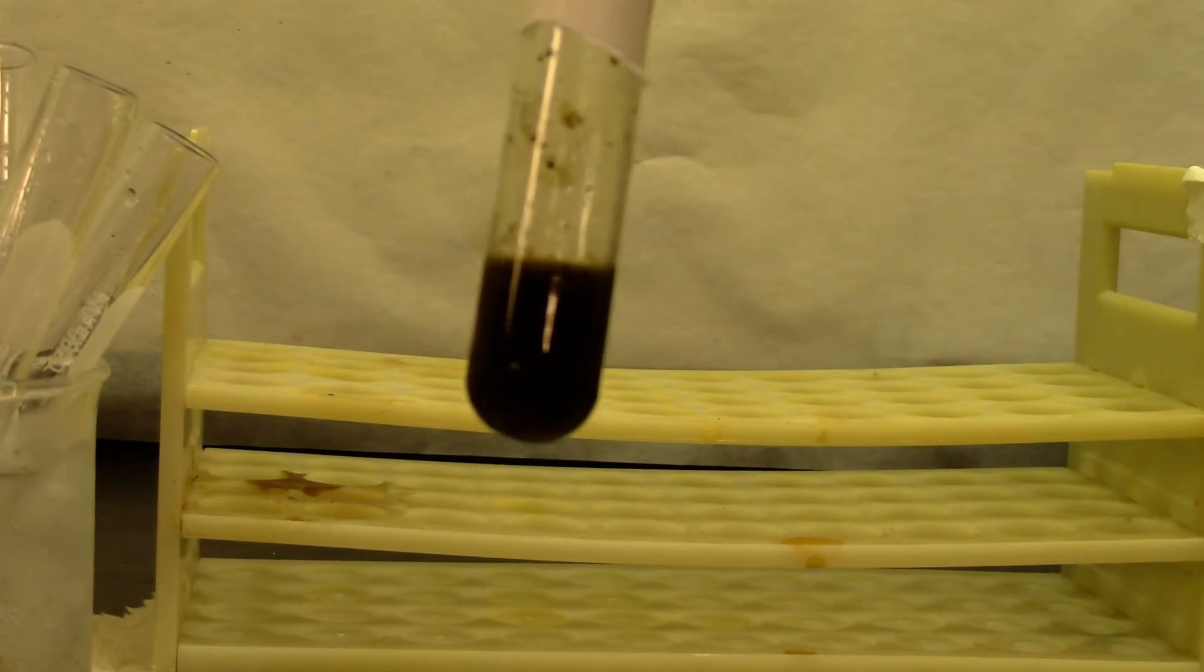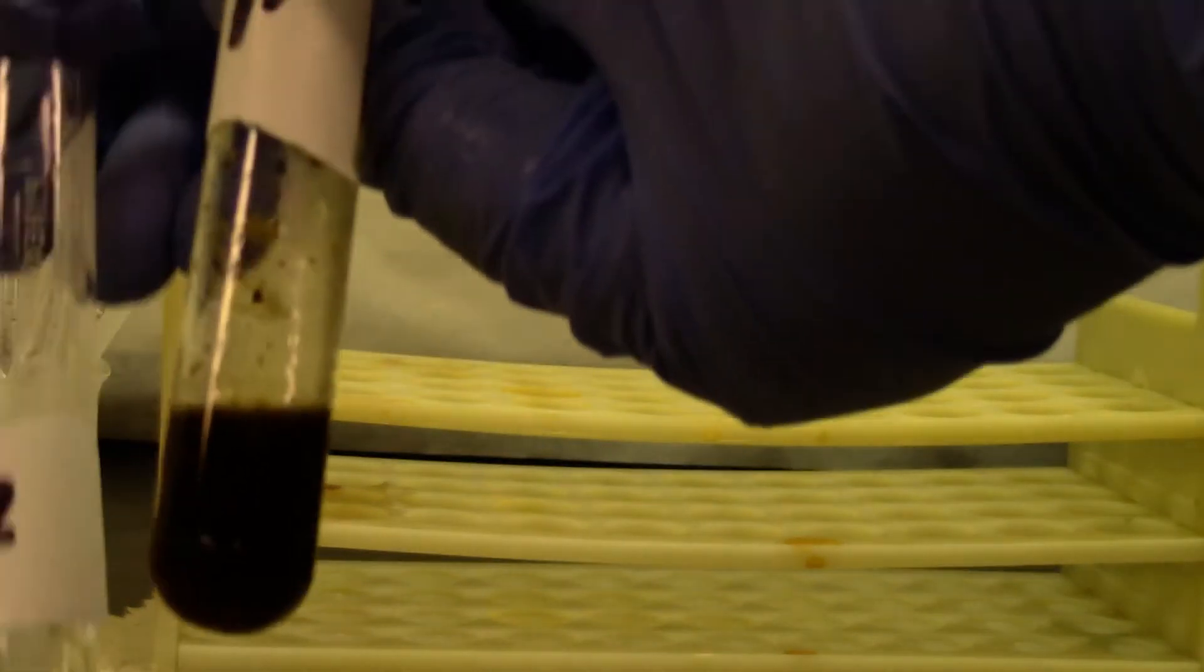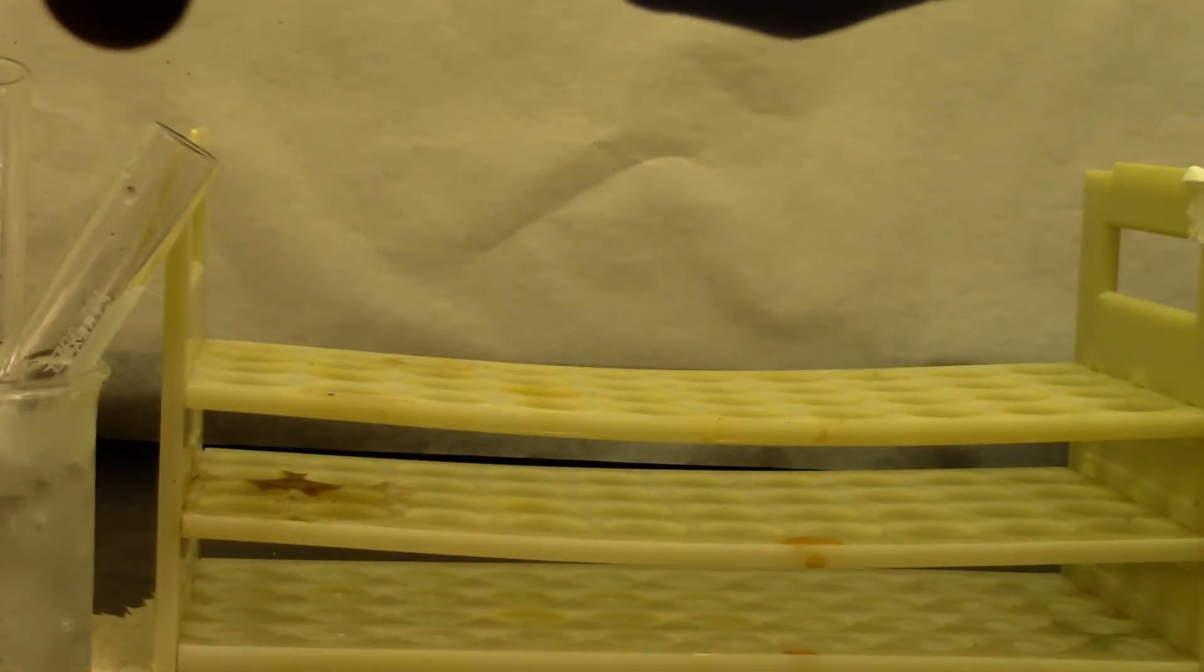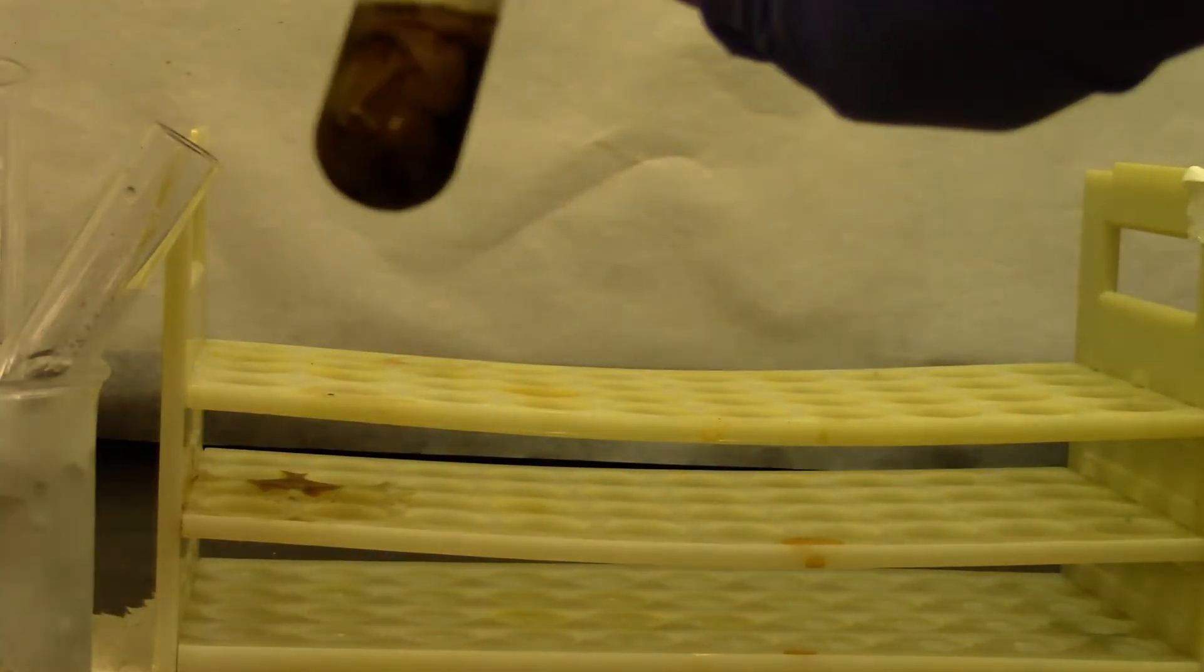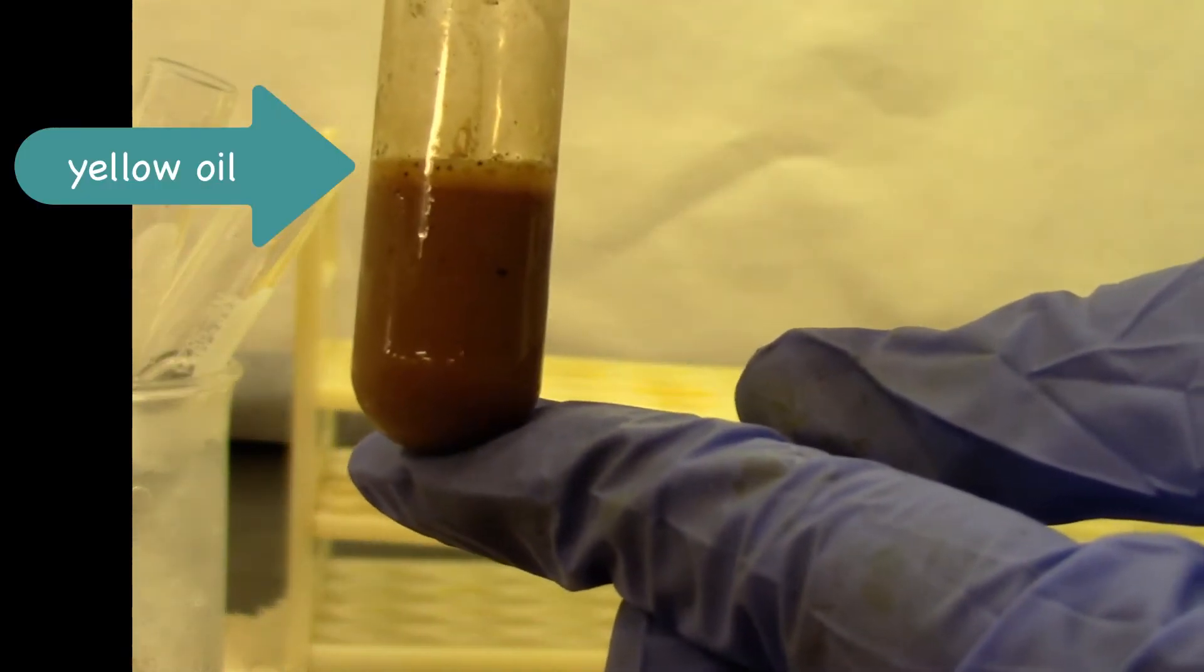This is my secondary amine, N-methyl aniline. I am going to add the sodium nitrite solution in here as well. There is an oily layer formation on the top, which indicates secondary amine.